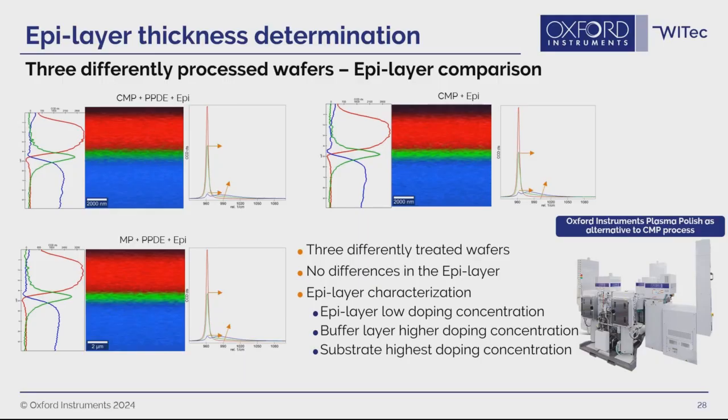When we have undoped or nearly undoped material, the A1 band at 960 reciprocal centimeters is very narrow and high. But as the doping concentration increases, the peak position shifts to higher wave numbers. If the doping concentration is very high, an additional effect occurs.